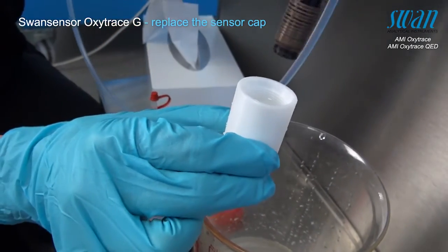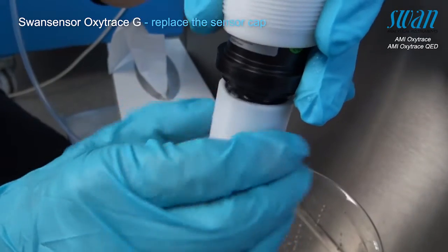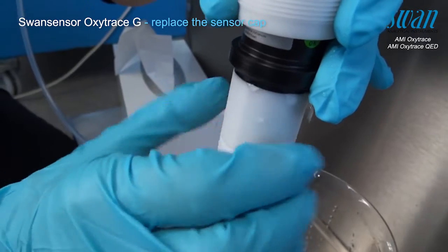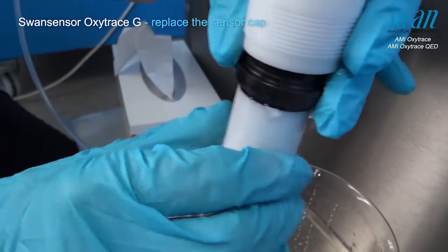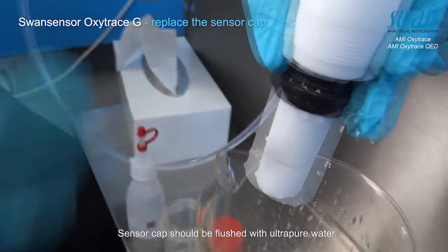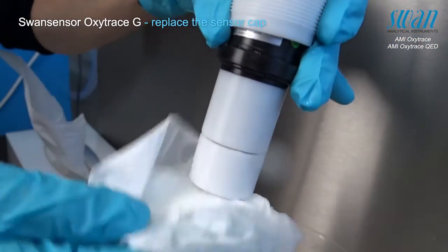This allows for simple exchange and guarantees proper function of the sensor. A groove can be found in the thread of the sensor which allows excessive air and electrolyte to escape as the sensor cap is fixed onto the sensor. This allows any present air bubbles to escape with the excess electrolyte through the designated groove in the sensor's thread. Clean the sensor thoroughly and dry the sensing membrane with a soft paper tissue.